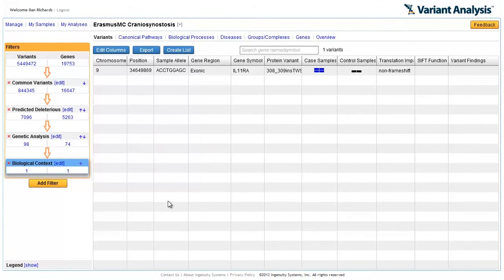The genotype and inferred functional impact of each variant is visualized for each sample. In this example, the two affected children both have a homozygous loss of function for a variant which is heterozygous in both parents.